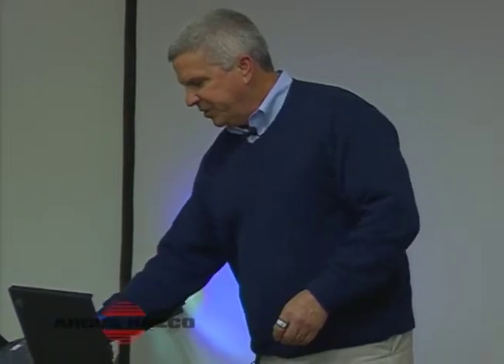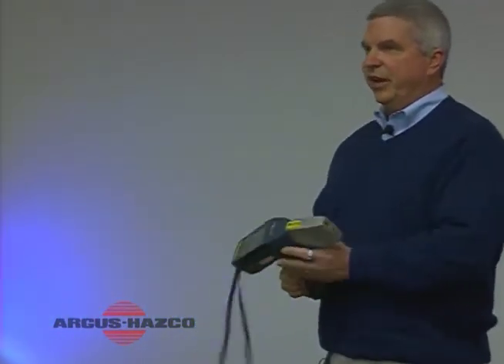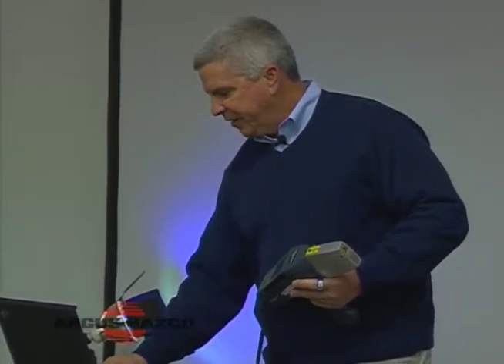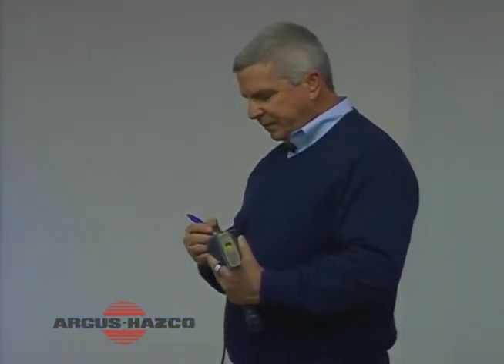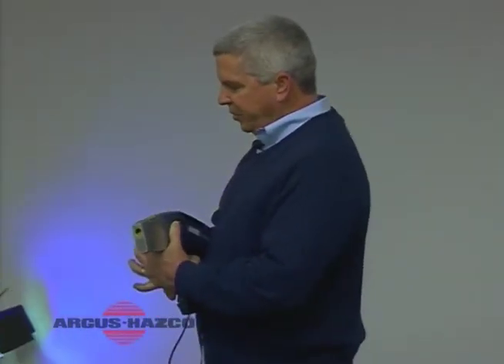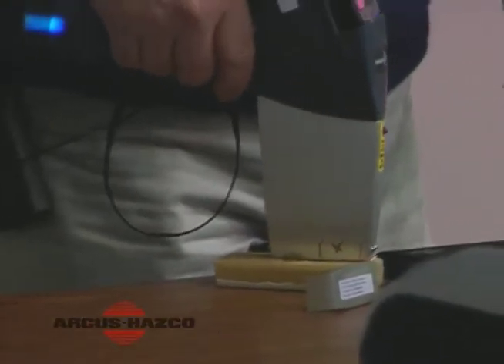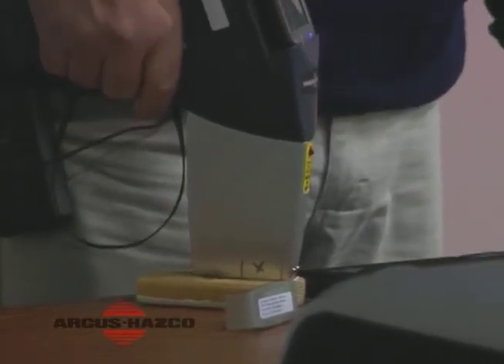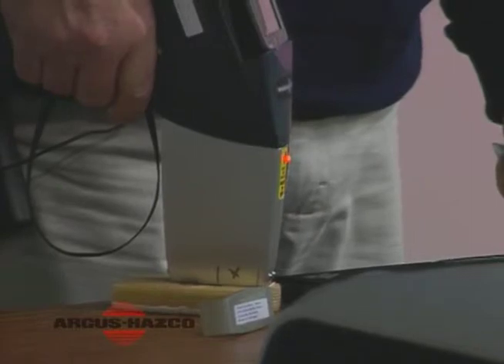Now, what you do when you get into the lead paint, even though we did a standardization with the soil, you check a known standard, say, okay, it's reading inspect, that's fine. But in the lead paint, you actually have to test another NIST standard, a paint standard, okay? So, when you're looking at this, you go to File, and you go to Calibration Check, and it wants you now to put the window right over that sample and then tap the OK. So you need 2 hands for this one. And now it's going to shoot that.